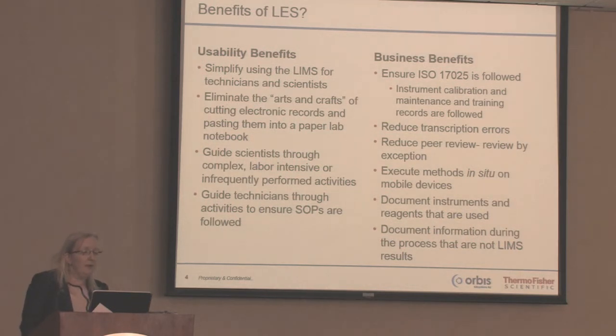So the benefit of the LES is really to simplify the process for the analysts, to make it clear to them and make sure that everybody is following the same steps. You can guide them through the method in the way that you want them to follow it.